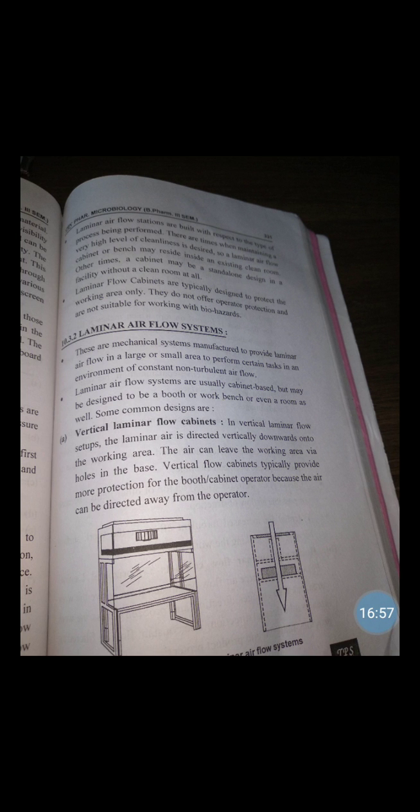Then, laminar airflow system. These are mechanical systems manufactured to provide laminar airflow in a large or small area to perform a certain task in an environment of constant non-turbulent airflow.